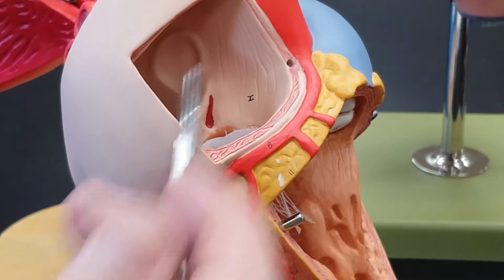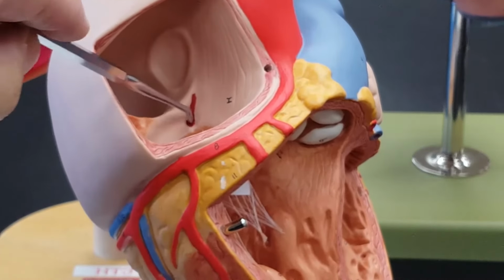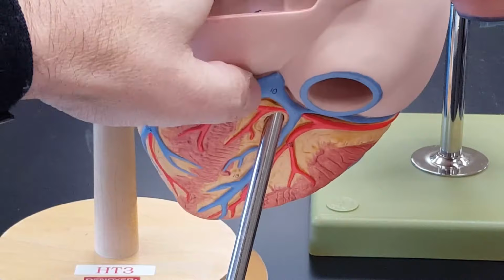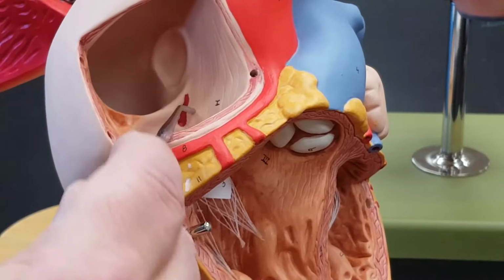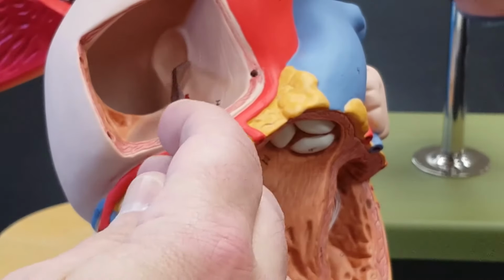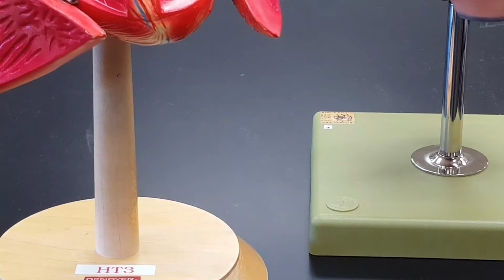Fossa ovalis. And this hole, where I'm putting my probe right now, this hole in the right atrium again, is the opening of the coronary sinus. This is where that coronary sinus, you may recall, it's under my thumb right here, dumps blood into the right atrium. And what they do on most really nice models is the model builder just throws a little splash of red paint right there. So inside the right atrium, I see a fossa ovalis and the opening of the coronary sinus. I think I can see this same pair of structures on other heart models.